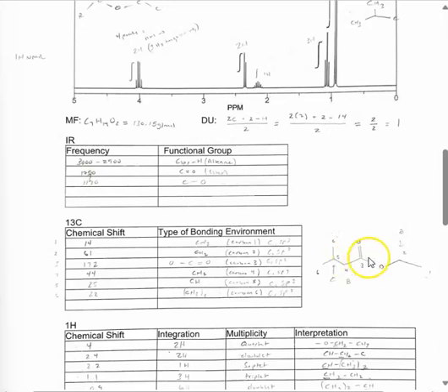The carbon that we are talking about, which does not contain any hydrogens, is carbon 3 in this rough sketch. So we have the CH2 group at carbon 4 connected to carbon 3 and carbon 5 here. Next, we'll look at the 2.2 peak, which is this carbon here, carbon 5, and we have a 1H integration since this carbon carries only one hydrogen and is connected to these 2 methyl groups.